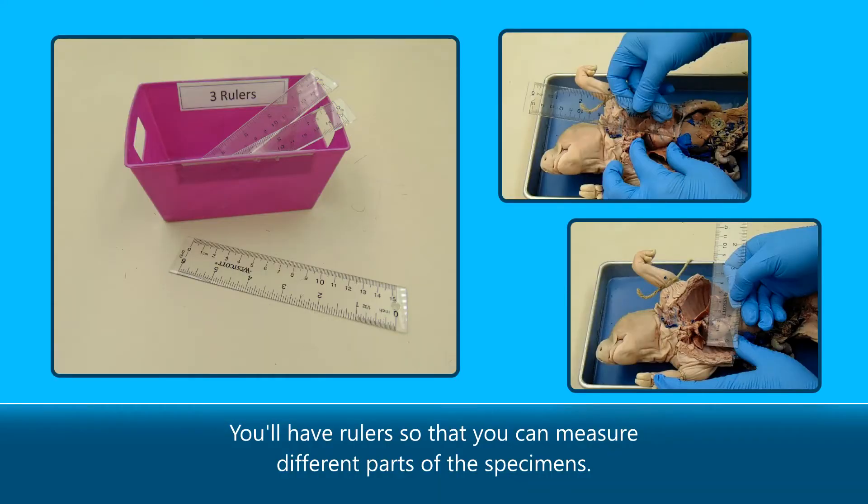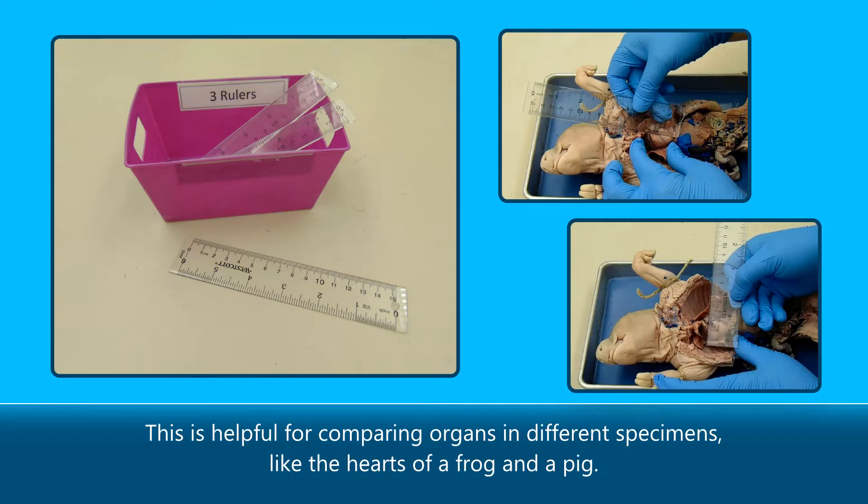You'll have rulers so that you can measure different parts of the specimens. This is helpful for comparing organs in different specimens, like the heart of a frog and a pig.